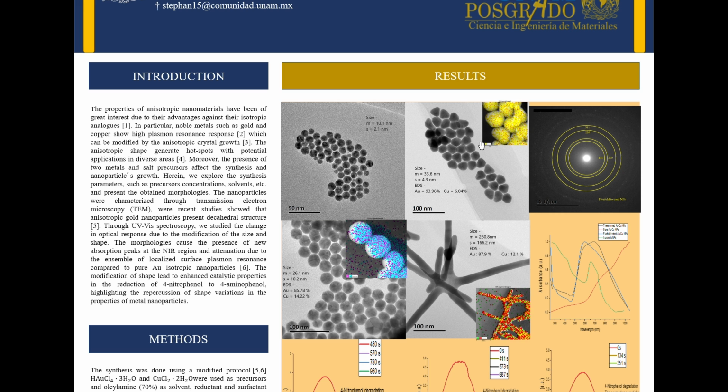The second transmission electron microscopic image is a 3-arm gold-copper nanoparticle, and it was made by seed-mediated growth. Also, the third transmission electron microscopic image was done through the seed-mediated growth pathway. As we can see here, we obtain different structures, one 3-arm, another 5-fold twin nanoparticles.